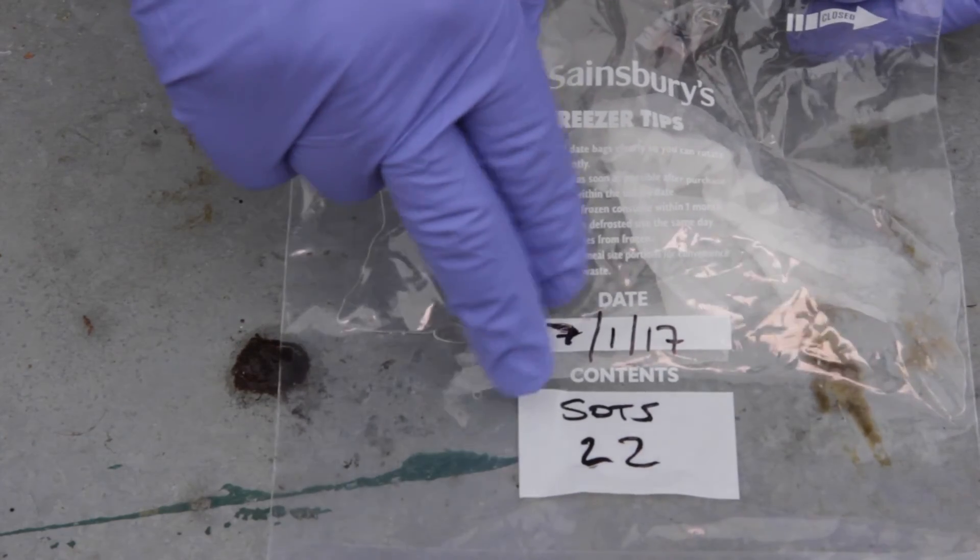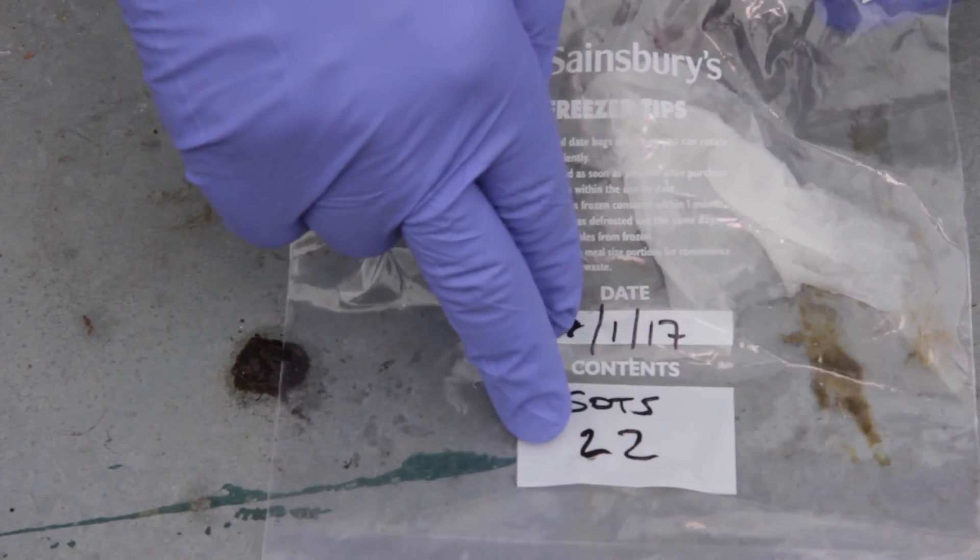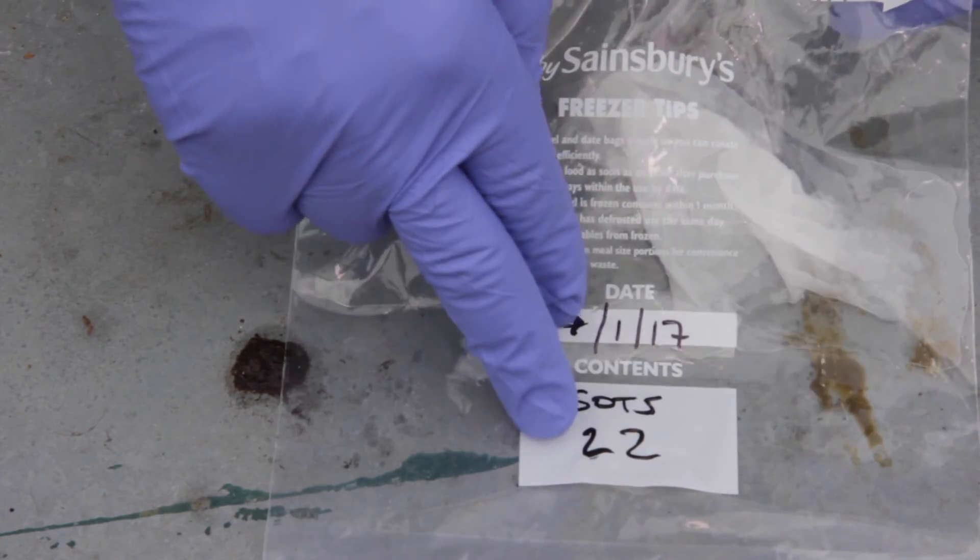We've got the date and the apiary identifier. This is a nuke which has got the number 22, so we're going to take the top off and take a sample of bees.